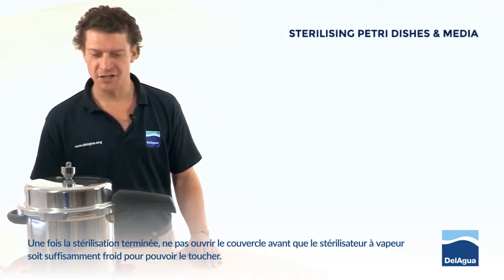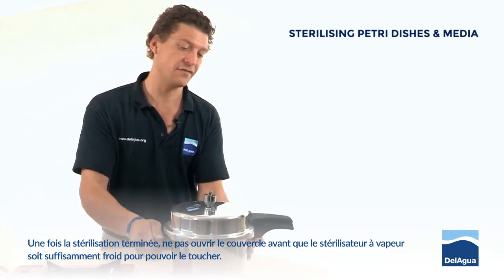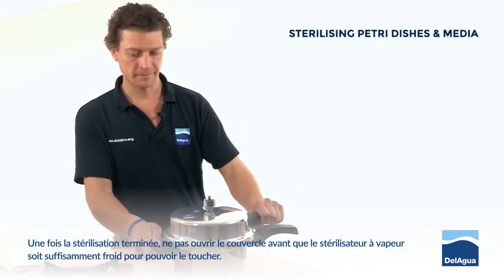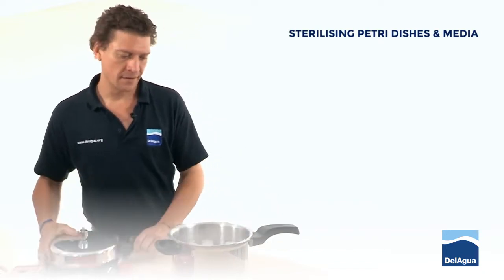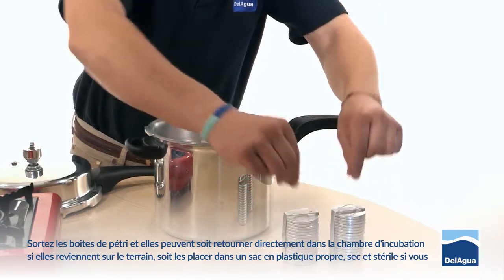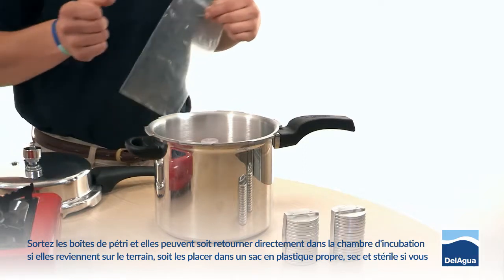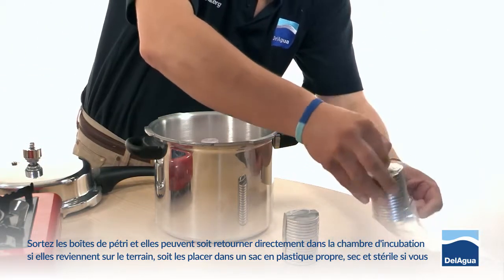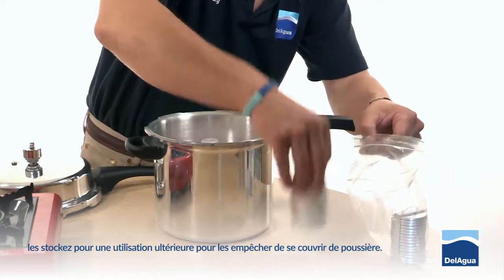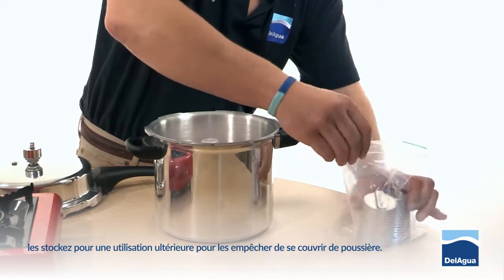Having finished the sterilisation run, do not open the lid until the steam steriliser is sufficiently cool enough to be able to comfortably touch. Take my petri dishes out. They can either go straight back into the incubation chamber if they are going back out into the field, or if you are storing them for later use, a good idea is to place them into a clean, dry, sterile plastic bag to prevent them getting covered with dust.